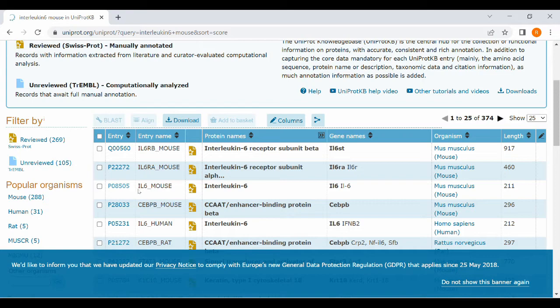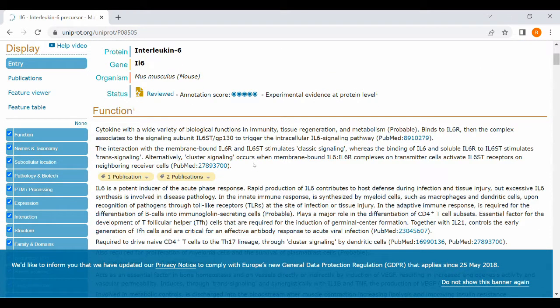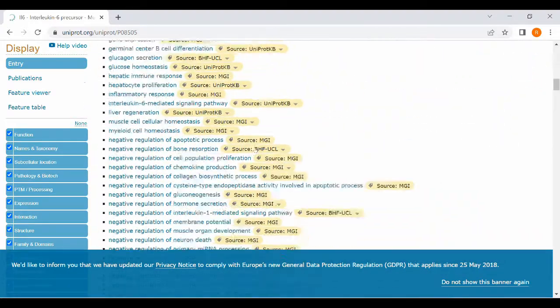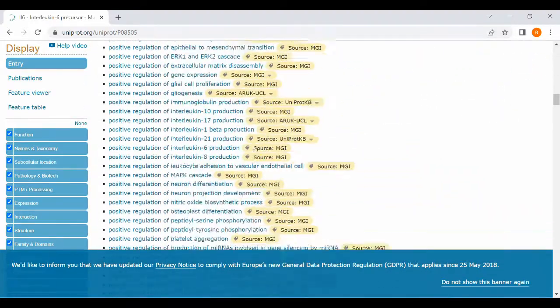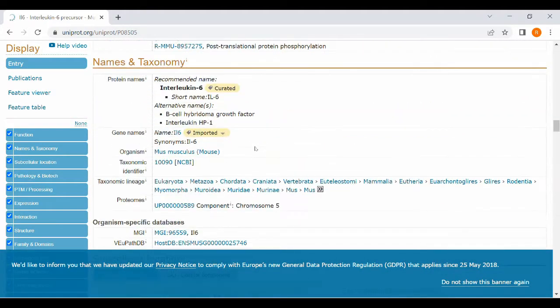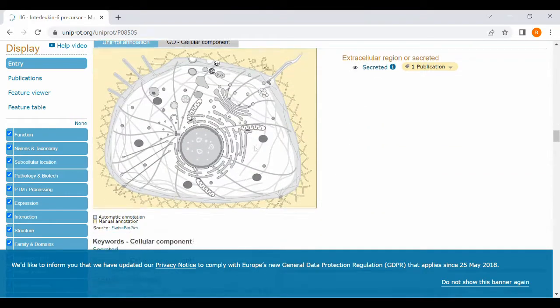It will give a lot of options. From that you select interleukin-6 mouse and look for CCDS sequence. It will give a lot of details. Just scroll down carefully and find out the CCDS sequence.